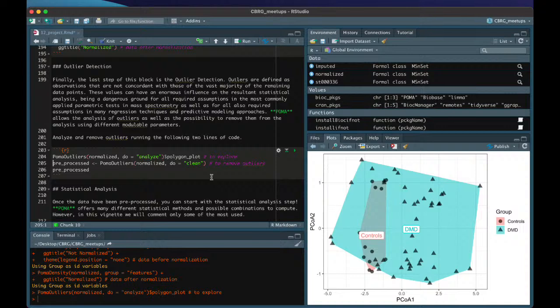And then with this distance, we can plot this polygon plot, or we can plot the outliers box plot, and then see if we have some samples super far from our group centroid. So we consider those samples as outliers. Excellent. We cannot consider outliers from all groups at once, because we can have two different groups in our data, and this is great.